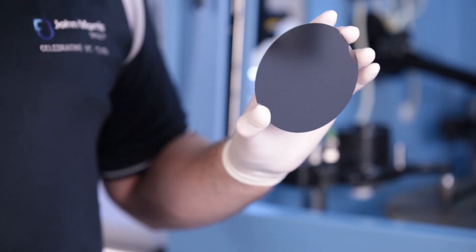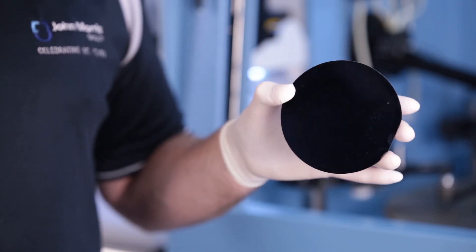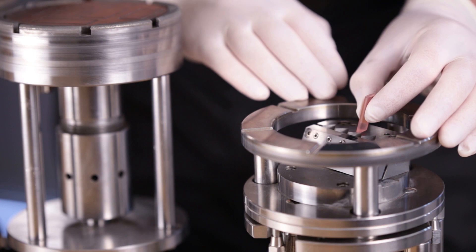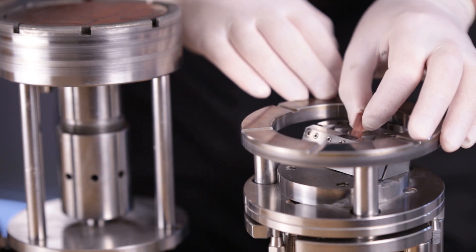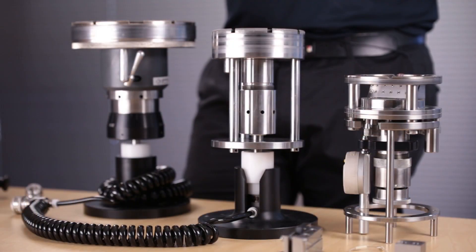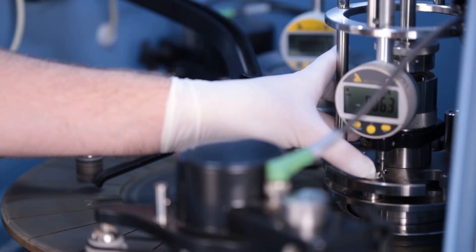Logitech also offers systems catering for optical electronics, optics and geological thin sections. Once the sample is prepared and ready for the lapping and polishing process, it can be loaded onto one of a variety of precision jigs suited to the sample size or shape. The precision jig is then loaded onto the lapping or polishing plate and jigs can be customised to cater for various wafer sizes or sample dimensions.